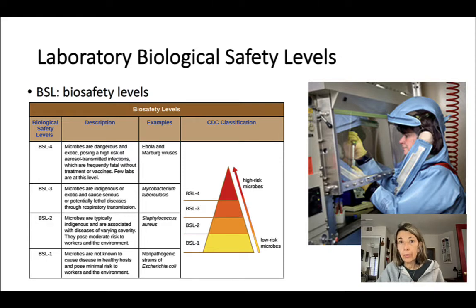We are going to learn in the course that bacilli, the group of gram-positive bacteria called bacilli, can form spores, and spores are like this very dry powder, which can obviously spread through the air and can be inhaled.